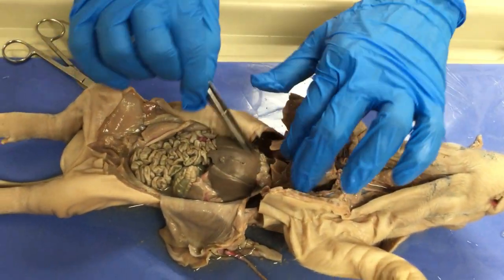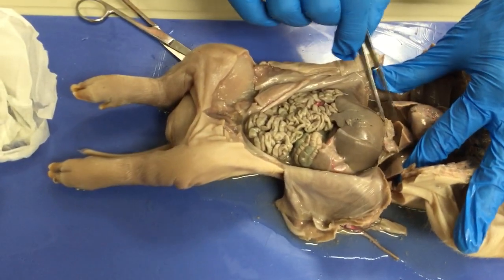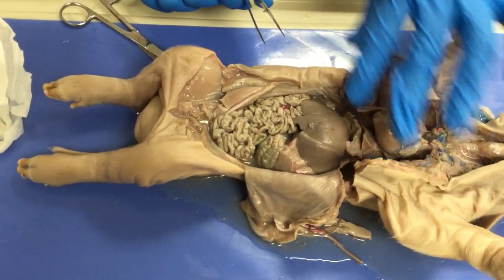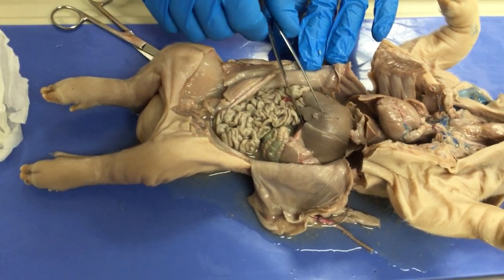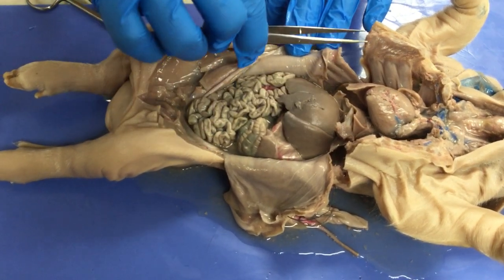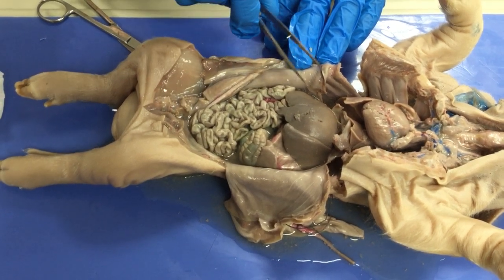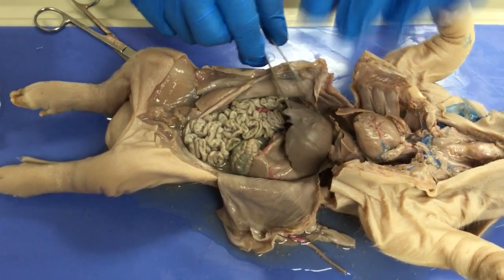Here we have the diaphragm muscle that separates the thoracic cavity from the abdominal cavity. In the abdominal cavity we have the major organs of the digestive system and other organs. We have the liver, which is the largest gland in our body, located in the right upper quadrant. Functions of the liver include metabolic regulation, hematological regulation, producing bile to help us digest and emulsify fats, and producing proteins that go into our blood.